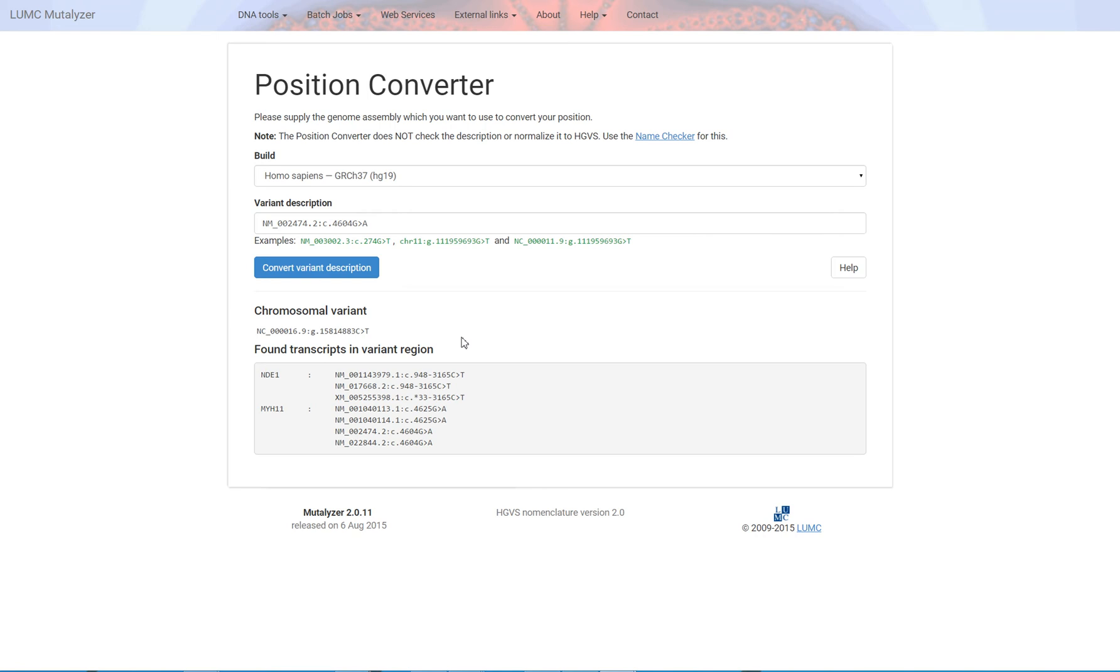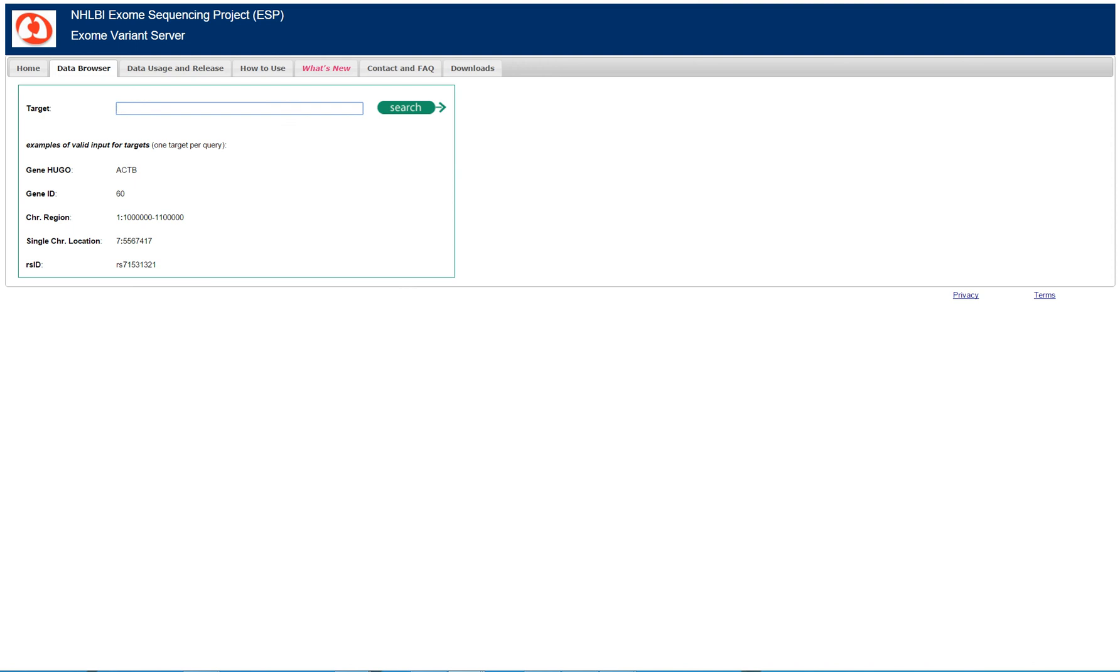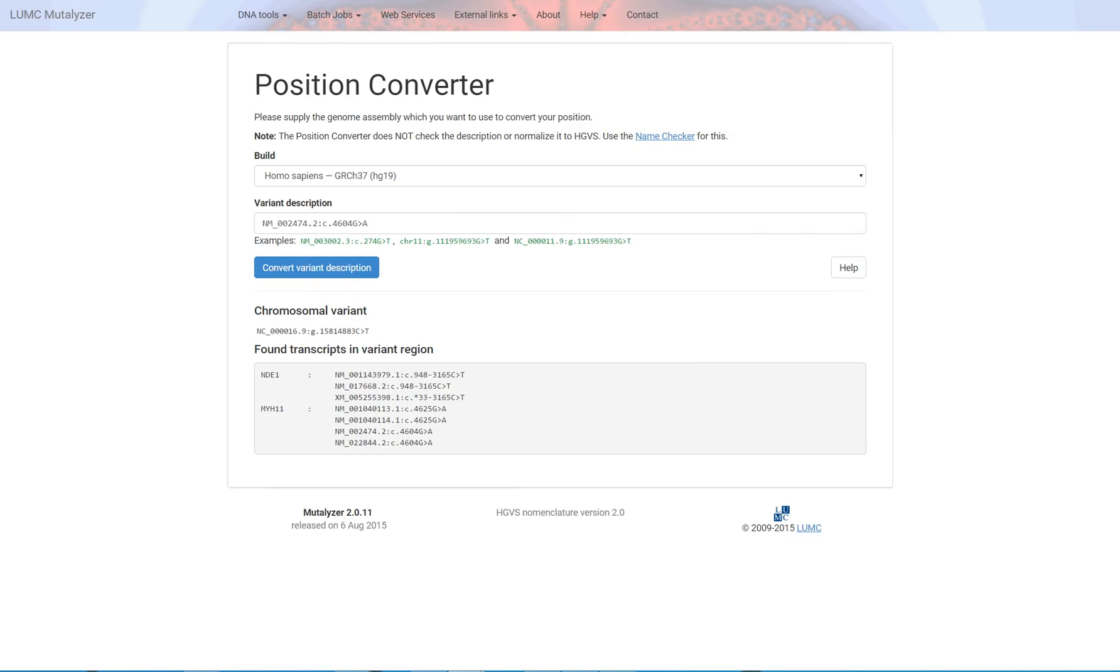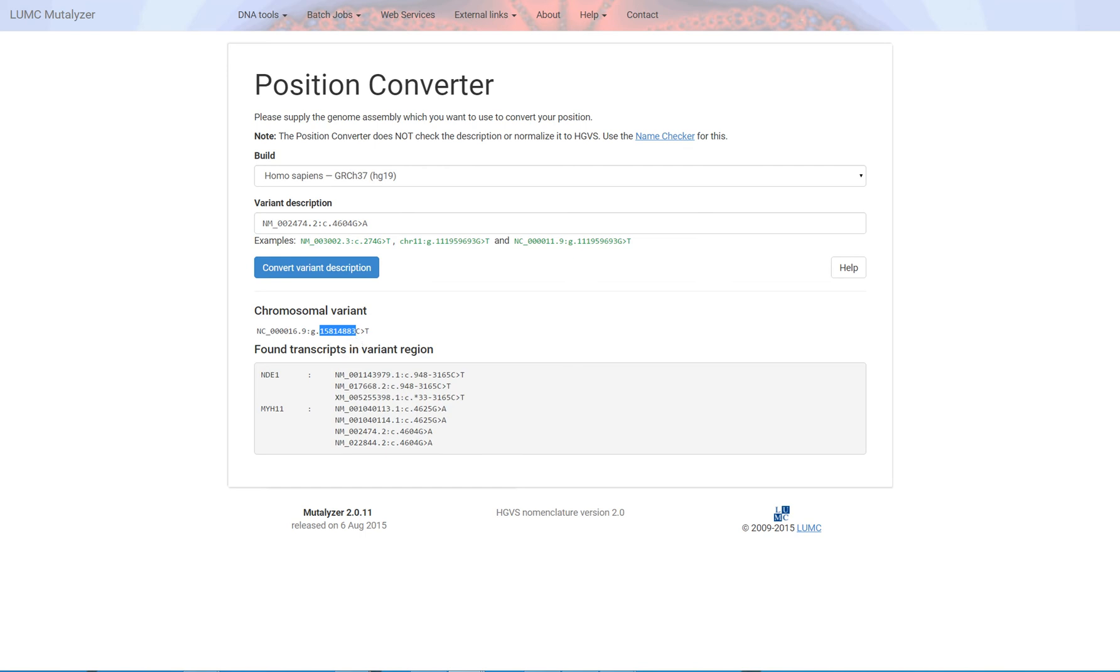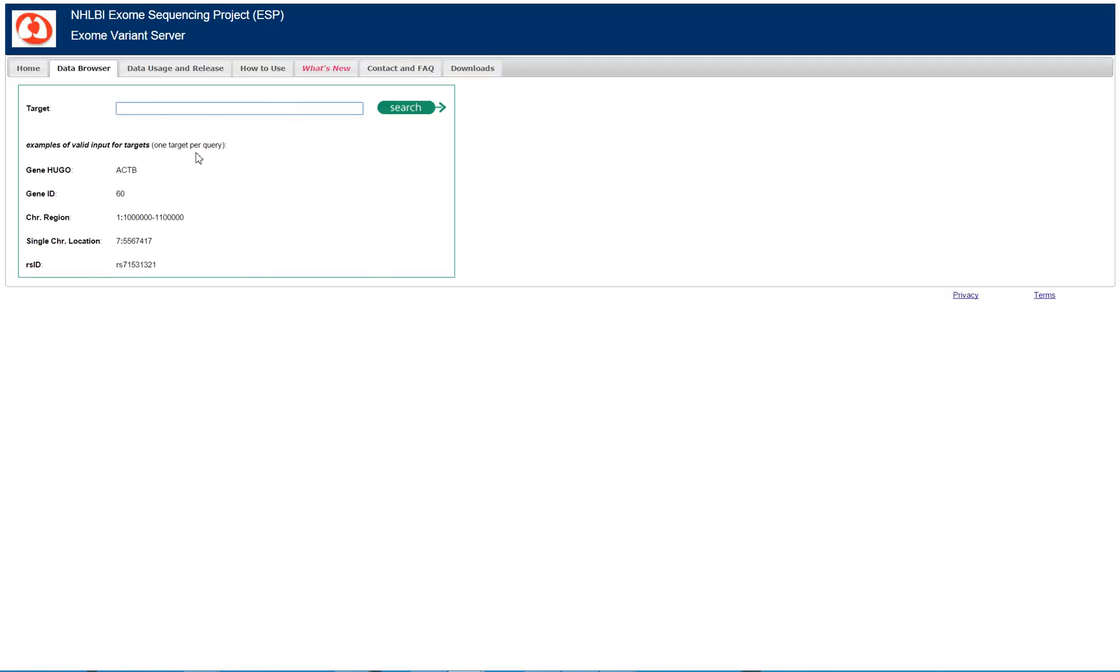If you know the genomic coordinates, you're able to use that to enter into the exome variant server. There are a few different ways to search. One of those is just by the specific chromosome location, or the genomic coordinates by chromosome. So I happen to know that this is a gene MYH11 that's present on chromosome 16, so the format for that would be 16 followed by the specific genomic coordinate.